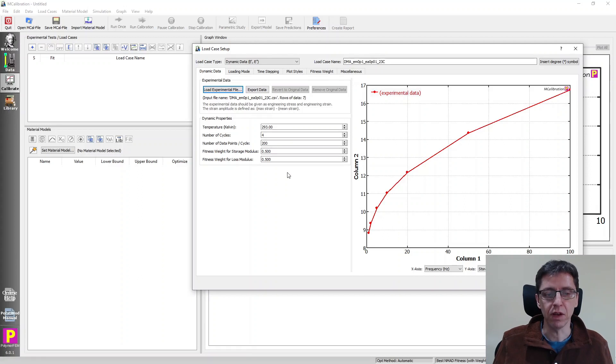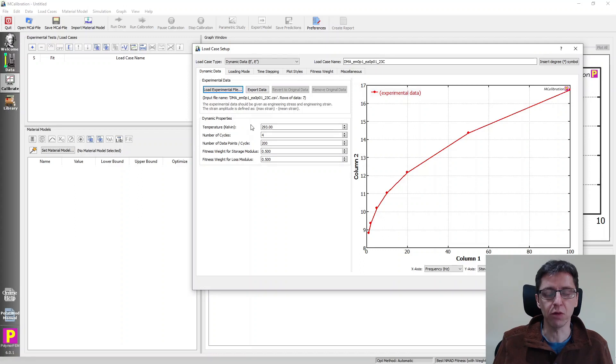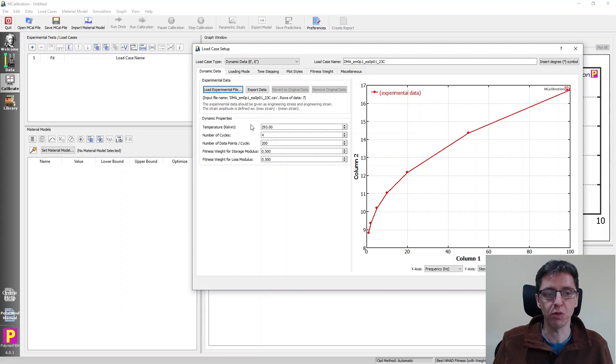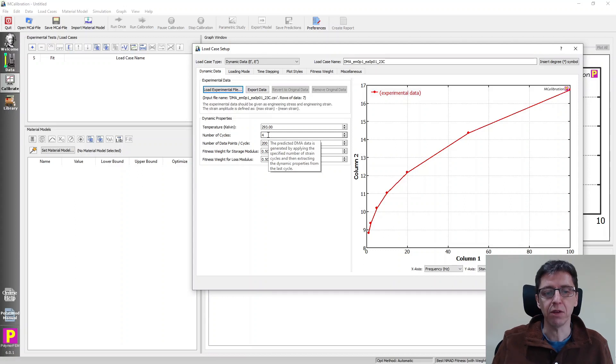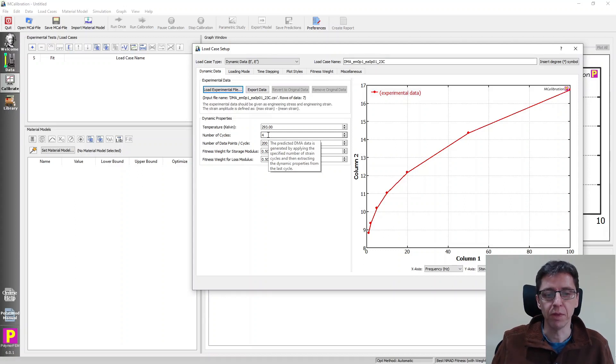Sometimes you have data at different temperatures, so you can specify temperature here. We don't need to worry about that here. All our data is at a temperature which happened to be room temperature. There's a feature here that says number of cycles. This is an important feature, and I will talk about that when I demonstrate how this works.